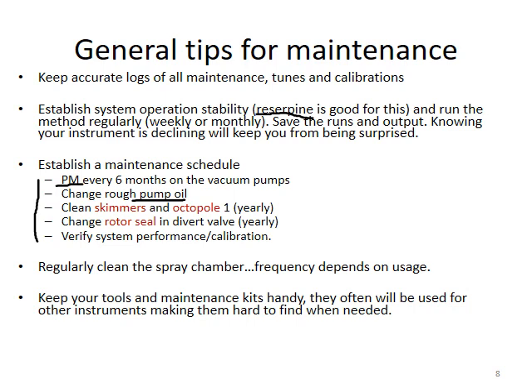And there is a divert valve. The rotor seal is a consumable, so you are supposed to change the rotor seal. If it's not done by you, it must be done by the service engineer. And this can be done on a yearly basis as well.